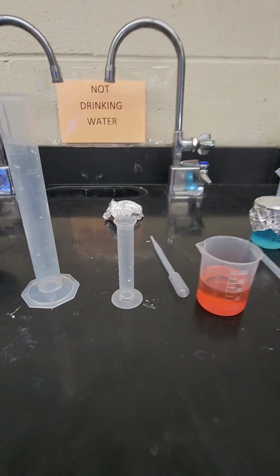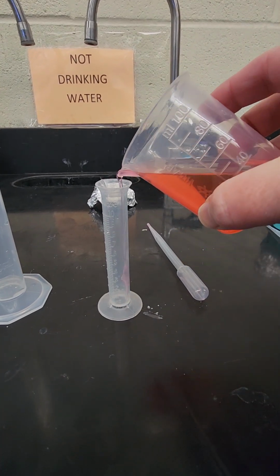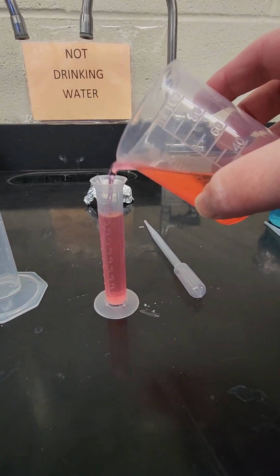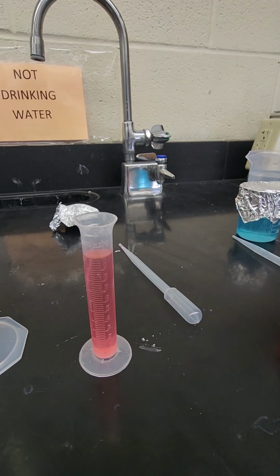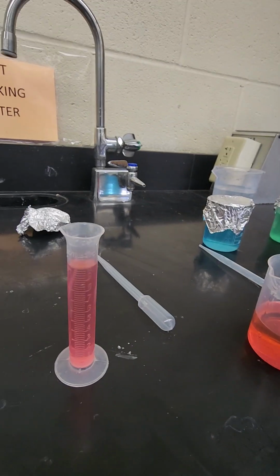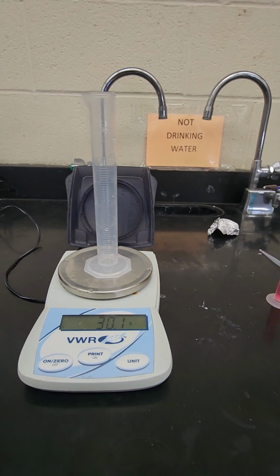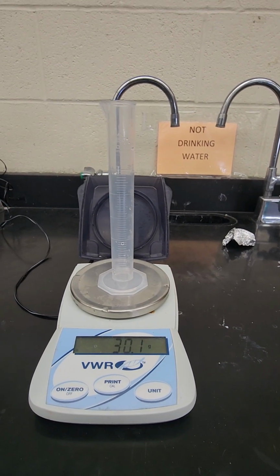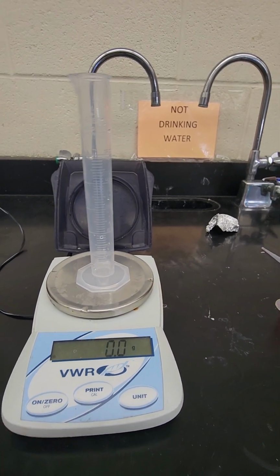What we're going to do is pour 10 milliliters of the first liquid into the 10 milliliter cylinder. I'm going to use the pipette and get eye level with it to make sure I actually have 10 milliliters. Before I can do that, I need to put the 50 milliliter graduated cylinder onto the balance. Then I'm going to press 0, so that it has 0 mass.